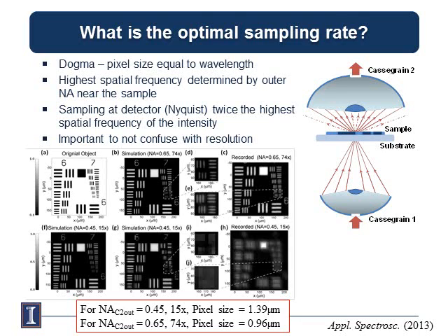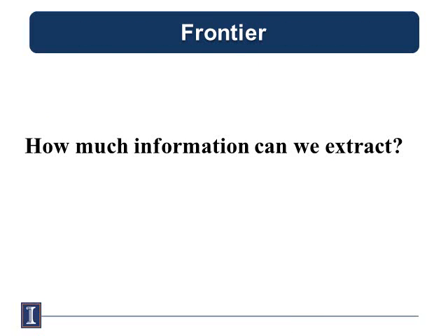So this is still older stuff. There's some even newer thought. Let me ask another question. What if we were not interested in wide field imaging, but we knew that in a given focal volume we had multiple particles that were different in spectra? Then how far could we push this? The spectral axis affords us a discrimination that we didn't think about before. And so we started asking that question. The key here is how much spectral information can we use to extract spatial information, and how much spatial information can be improved if we have spectral information. This interplay is not usually available in other forms of microscopy, but certainly in this case it is.